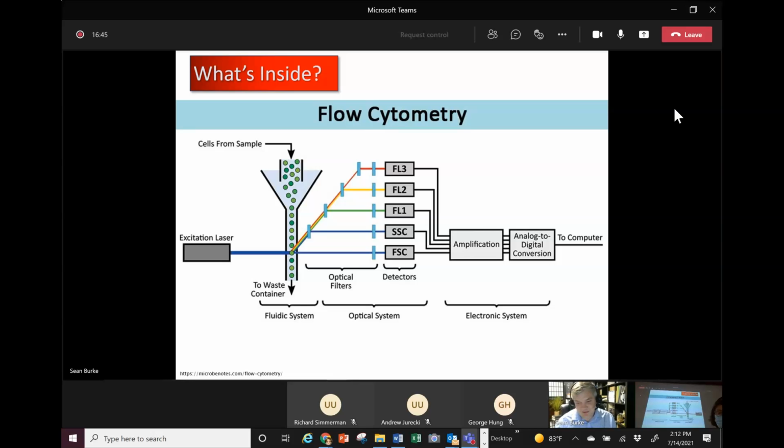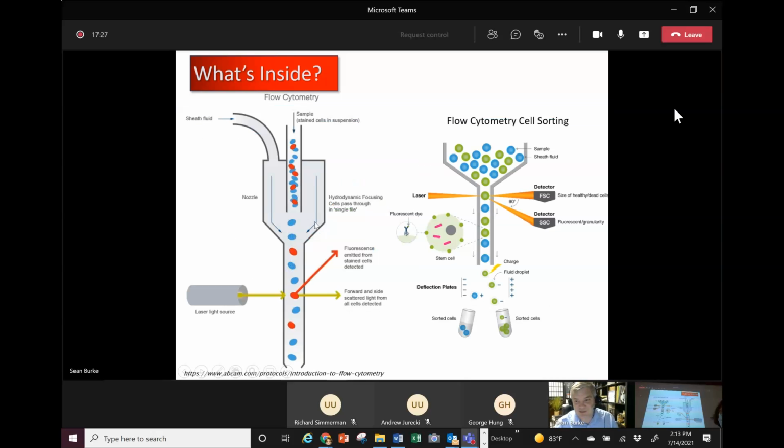And there are entire week-long, month-long courses devoted to learning how to build a flow cytometer and how all these things come together. But the good news for all of us as scientists and future scientists is that there are generally facilities within universities and research labs that have trained people on staff to work these things. If you have an experiment in mind that you want to do, they can tell you how to set that up and how to bring the cells to them. They run everything on the cytometer, and then they give you the data on the back end, and you can go back to your lab and analyze that. Those are called core facilities or shared resource facilities. They're really a fantastic tool when you start getting out there into labs.